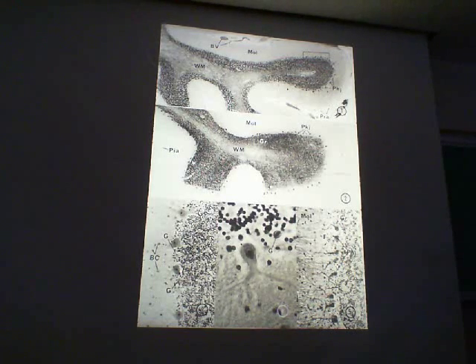Okay, what is this organ? Cerebellum. And that layer would be what? Molecular layer, and this would make that the, and this is what? White matter.